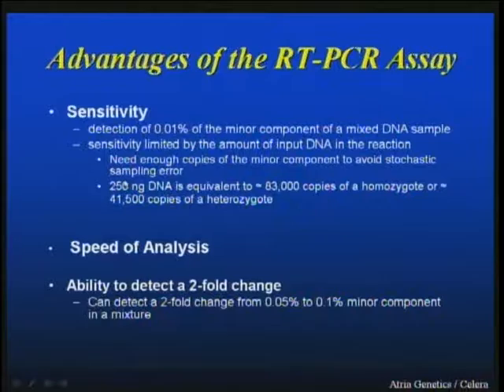One of the other advantages of the system is the speed of analysis. As I said, it's the click of a button, and the program does it for you. And then the company advertises that you're able to detect a two-fold change. But in our hands, and I admit this is a limited number of samples, this has been hit or miss. We haven't exactly been able to demonstrate, to detect a two-fold change at these lower levels of a minor component.